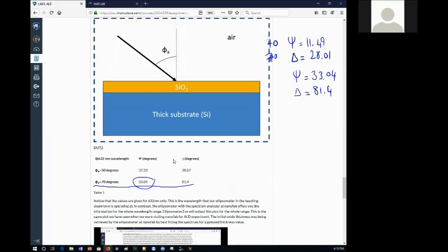So I wish we had like half an hour for you guys to work this around and see how the ellipsometer works by guessing the correct thickness, okay? But I will guide you now because we don't have that much time. I just guessed a thickness, 100 nanometers, right?